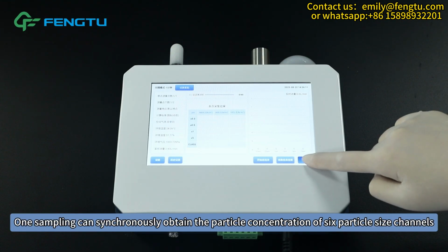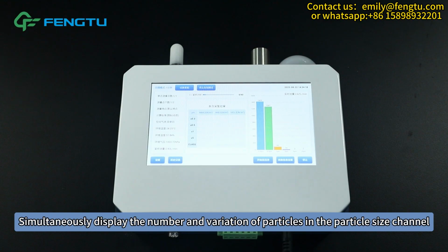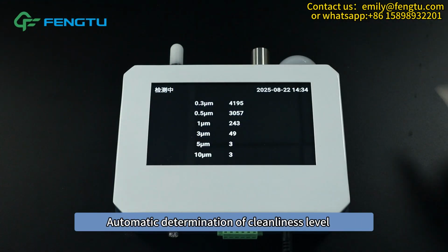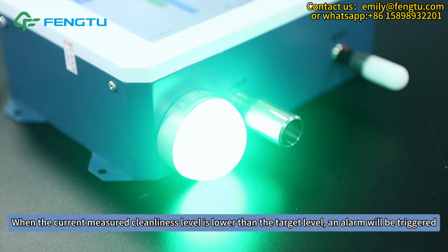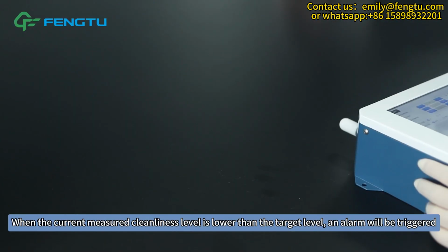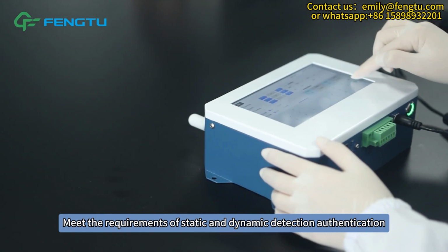One sampling can synchronously obtain the particle concentration of 6 particle size channels. Simultaneously display the number and variation of particles in the particle size channel. Automatic determination of cleanliness level. When the current measured cleanliness level is lower than the target level, an alarm will be triggered. Meet the requirements of static and dynamic detection authentication.